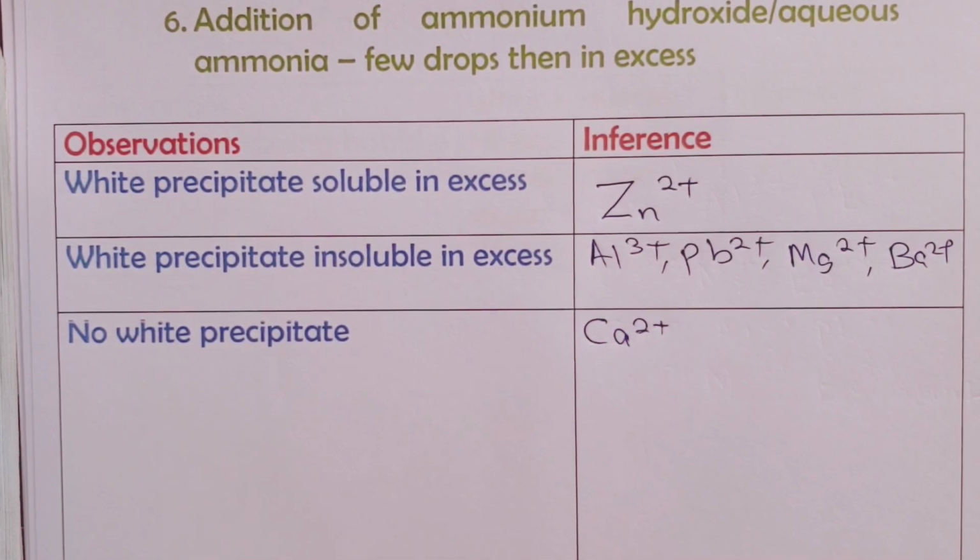But there is a condition. The condition here is that the ammonium hydroxide test may come after sodium hydroxide. So it may be a confirmatory test.